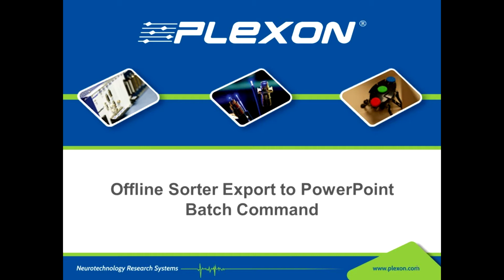We will also be going over some other basic batch commands, some of which we went over in more detail in our first offline sorter batch file processing video, the link to which you can find in this video's description.